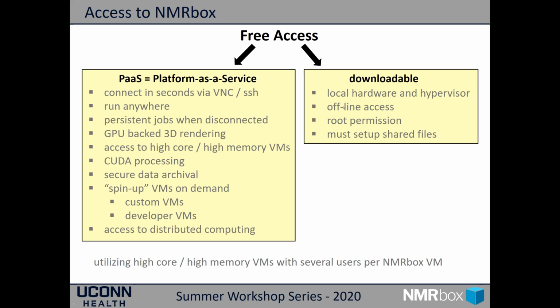The biggest benefit is you get offline access. So if you work remotely and you don't have internet access a lot, using a cloud-based platform isn't going to work very well for you. You also have root permission, so if you need to make lots of modifications to the NMRbox VM, obviously it's your copy, so you could do whatever you need to it.